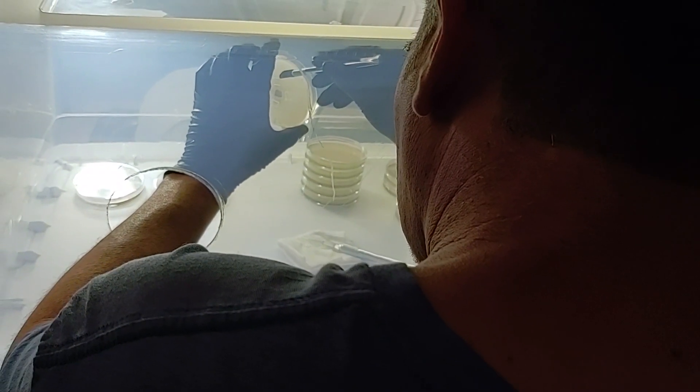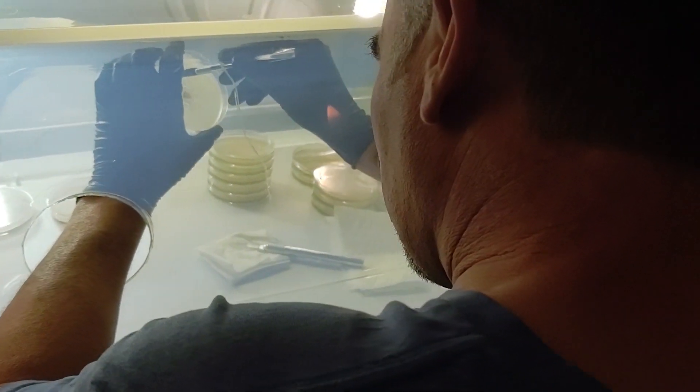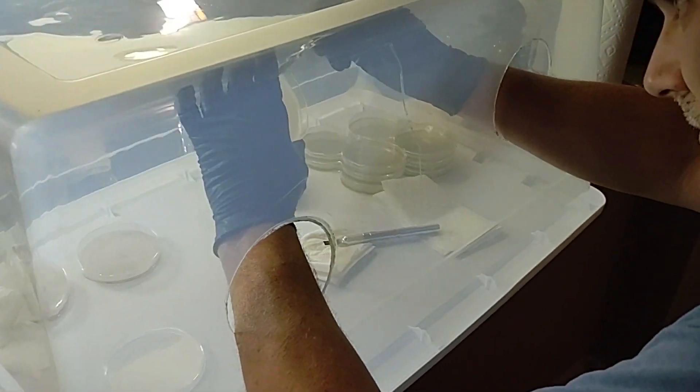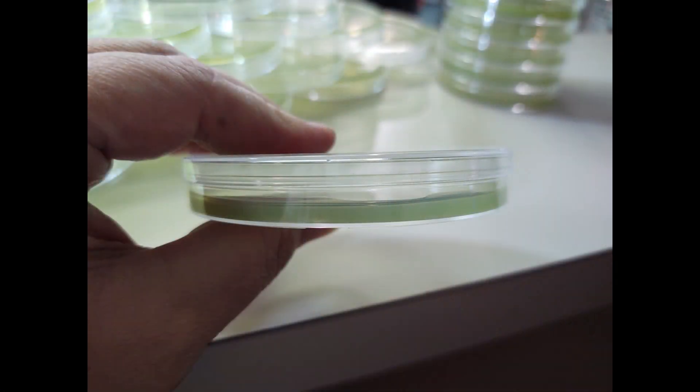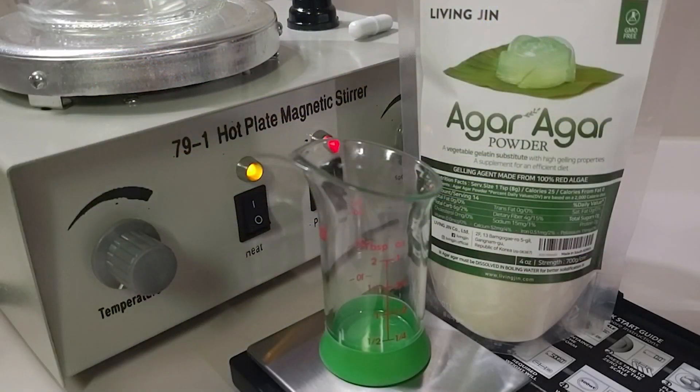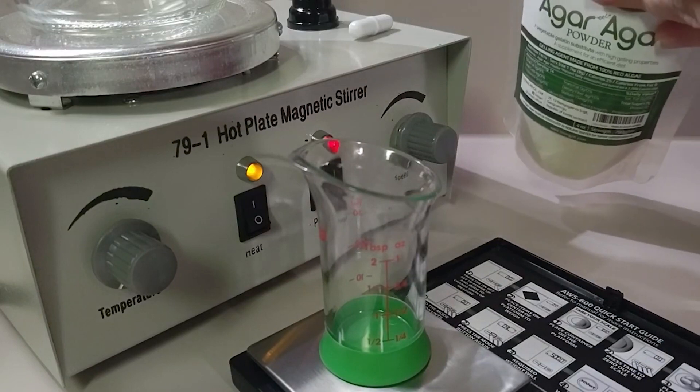Agar mycology is a technique that allows the cultivator the ability to grow out mycelium with the least possibility of contamination while achieving the best possible genetics. Mushroom spores are inherently dirty, so utilizing agar techniques allows the user to clean out any contamination before moving on to the next step of grain spawning.